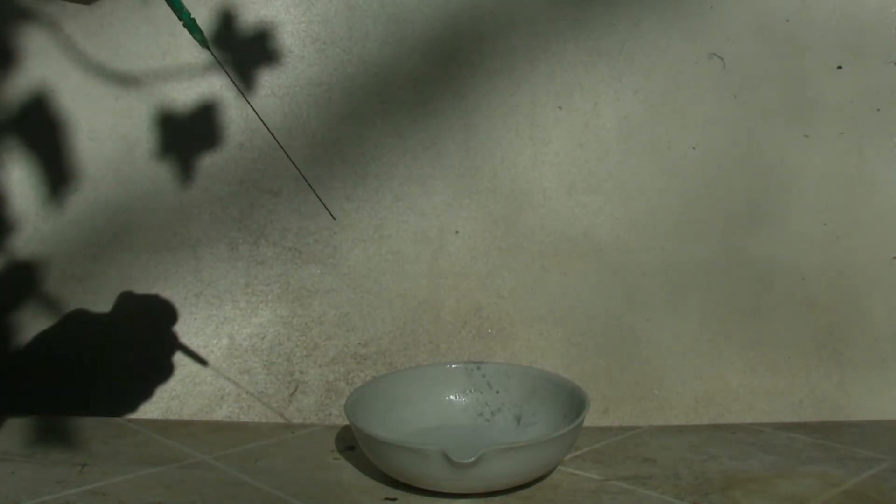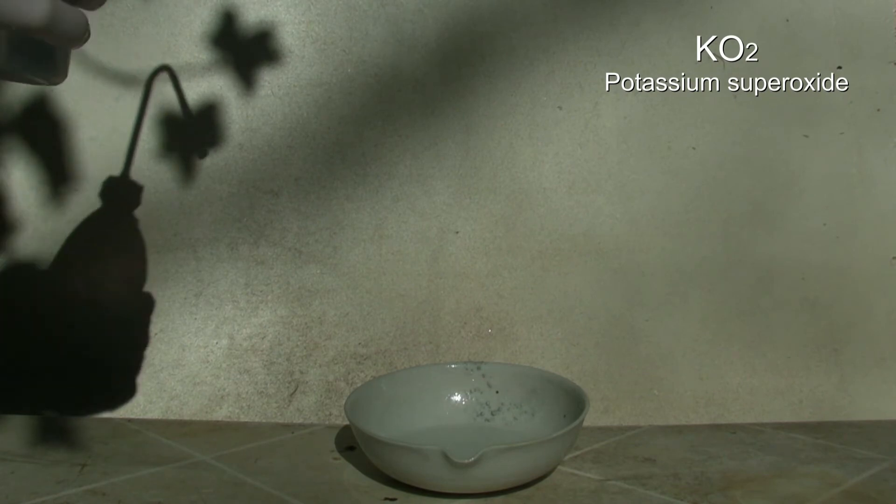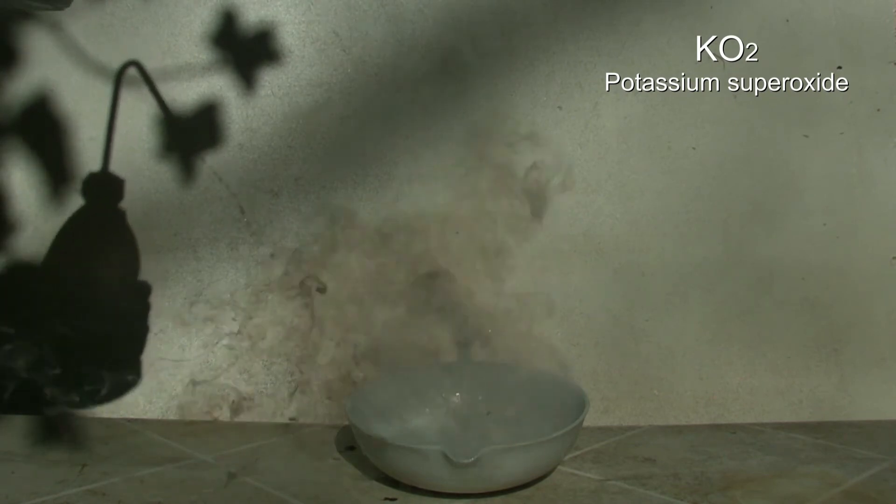The high reactivity is also the reason why NaK is used for drying solvents. In addition to that, the surface gets back into contact with the solvent faster after reacting because the alloy is liquid. NaK is usually made directly before it's used and used up completely, as it forms a layer of potassium superoxide faster than potassium itself, which can cause an ignition or even an explosion.